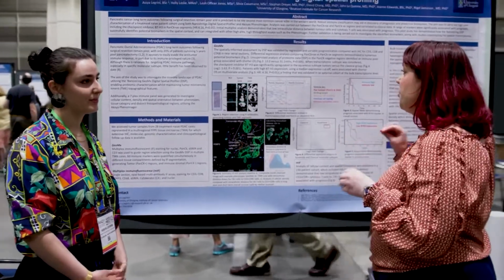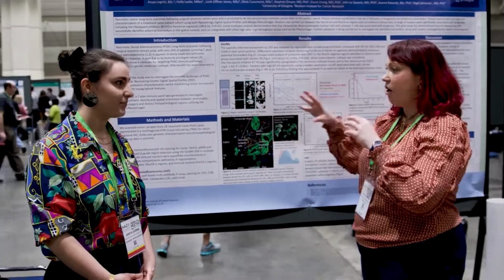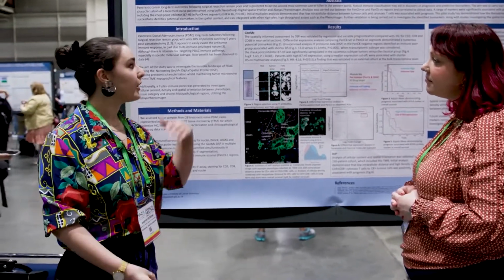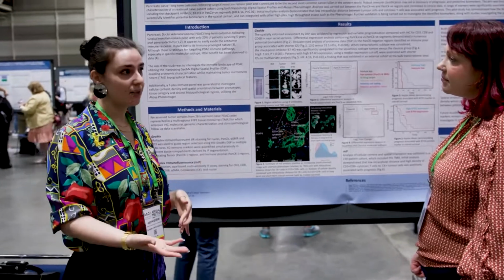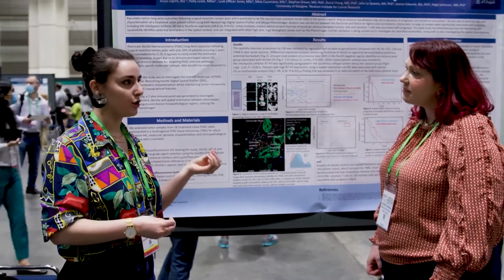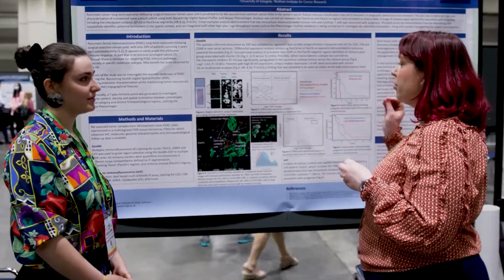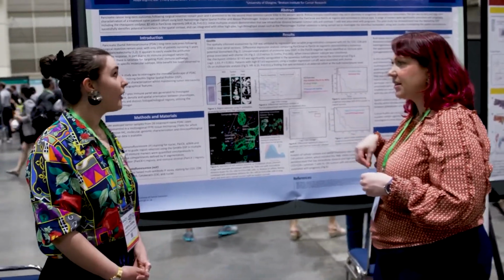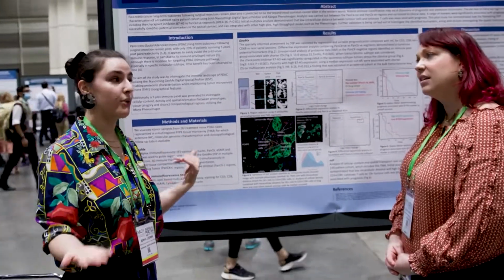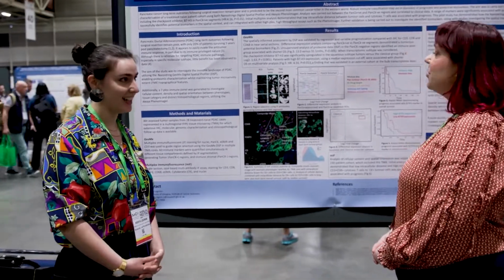I see. And so were you able to profile the tumor and the tumor microenvironment and segment out each region of interest? Yeah, definitely. So we used a pan-CK positive mask for the tumor areas and then a pan-CK negative mask for the tumor microenvironment areas, to really elucidate the differences between the tumor and the tumor microenvironment, which we're really interested in. And were you doing protein or RNA with the GeoMx? Okay, so for this particular example, we're doing protein, but we are doing RNA. So we've done a whole range of all the different panels, including the whole transcriptome atlas.